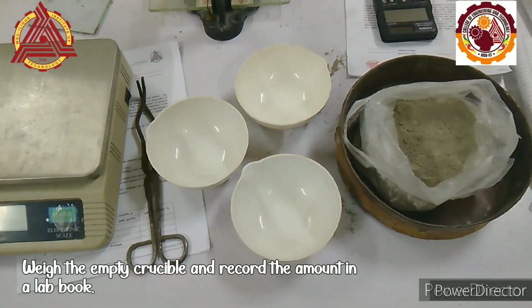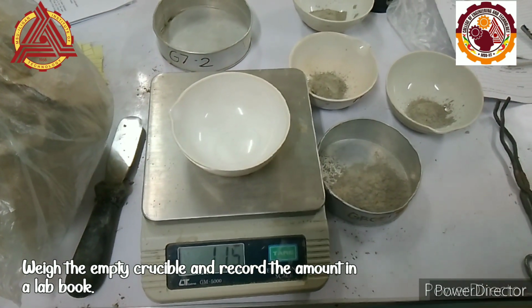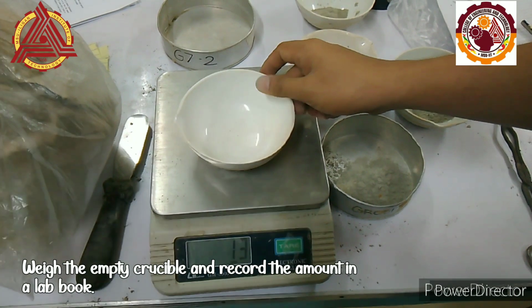The first procedure is we have to weigh the empty crucible in a high precision mass balance and record its weight in a lab book.